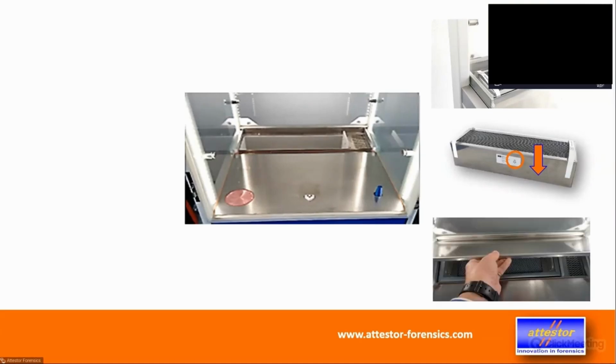Pretty simple to just slide in, and then on top of that we have a cover. The reason for that cover is when we ran our first prototype with a customer in real life, he said, okay, I'm going all in. I will run a real case on your cabinet straight for the first run. But for that, I have to do a DNA decontamination.